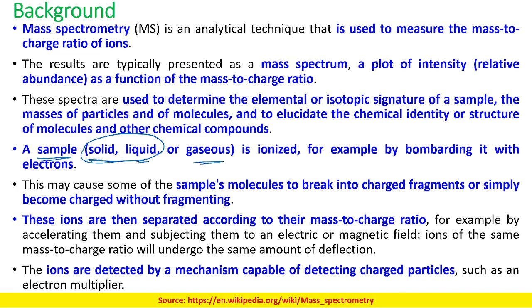We can immobilize the samples within a matrix, and then use a very high power laser to ablate the matrix, which helps in the generation of very fine particles or fine aerosol particles, and those particles are then made to enter the ionization chamber.